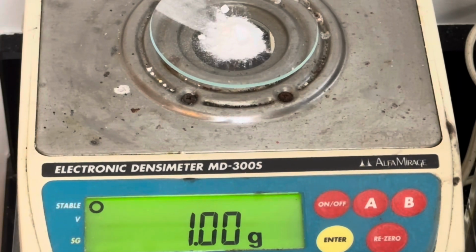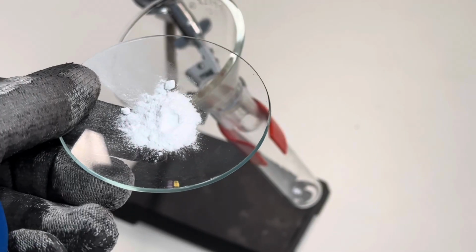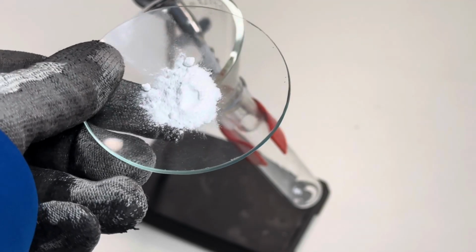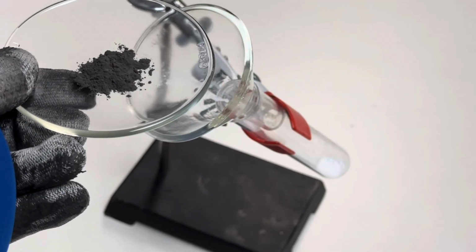Begin by measuring 1 gram of potassium chlorate. Next, measure out 1 gram of nickel. Rather than mixing the two together, add your potassium chlorate first to your test tube. Next, add your nickel.